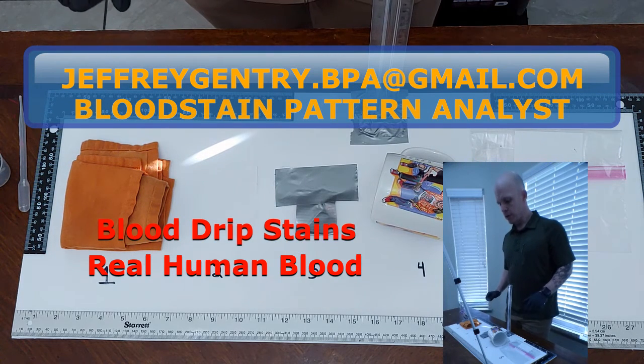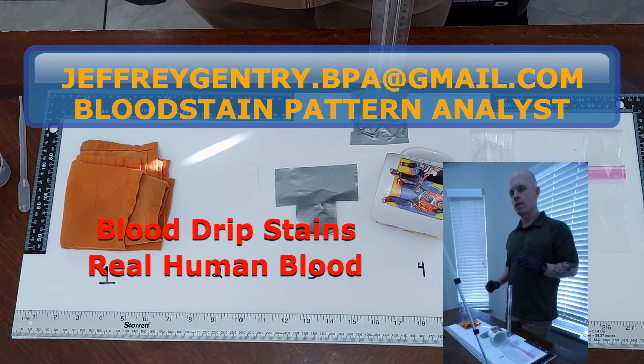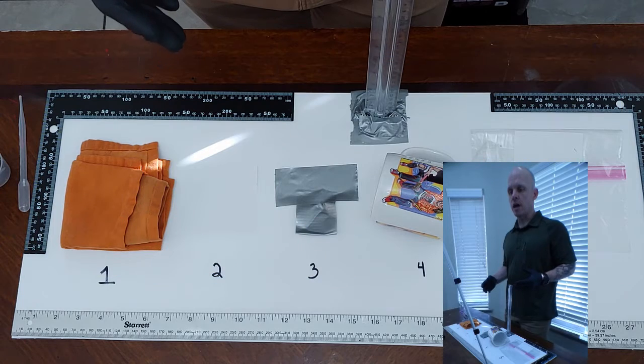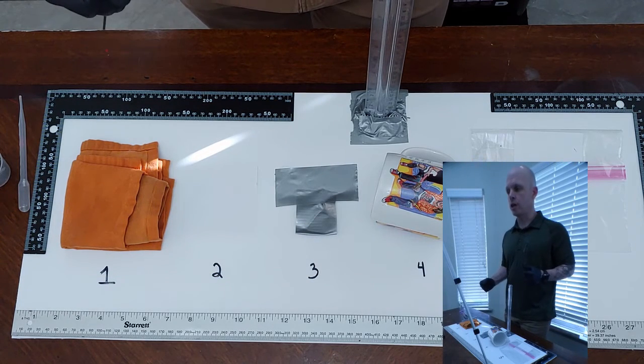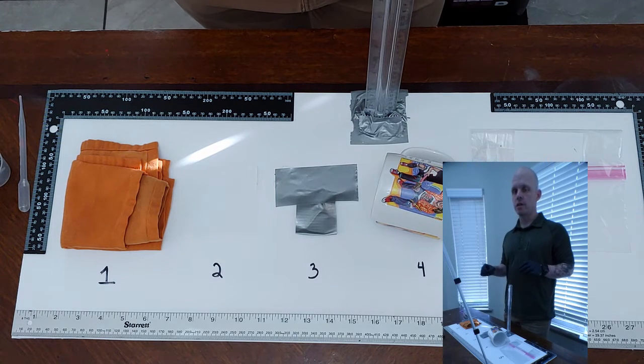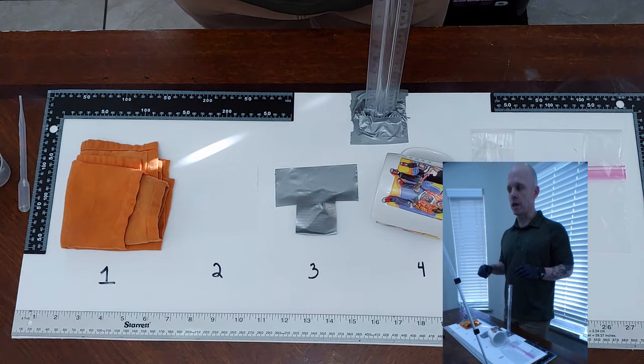What I'm going to do today is create some blood drip stains. And remember, a blood drip stain from previous videos is when blood accumulates on a surface, creates enough blood that it forms a blood drop, and then gravity makes that blood drop fall to the surface, and it strikes the surface at approximately a 90-degree angle. There can be some variation in angles with drip stains. But today we're going to look at when blood hits a surface perpendicular to the surface, so at 90 degrees.